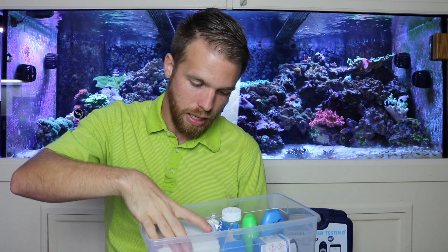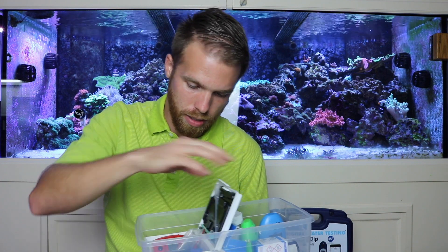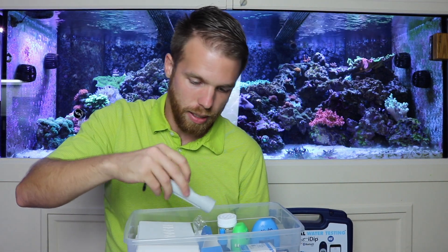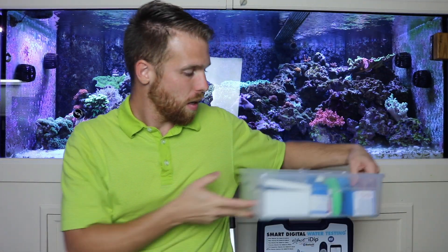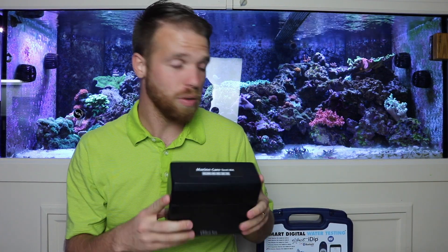I've got the calcium Hanna checker in here as well. And I've got the reagents here for the Red Sea calcium, plus the Red Sea magnesium and Red Sea Marine Care test kit.